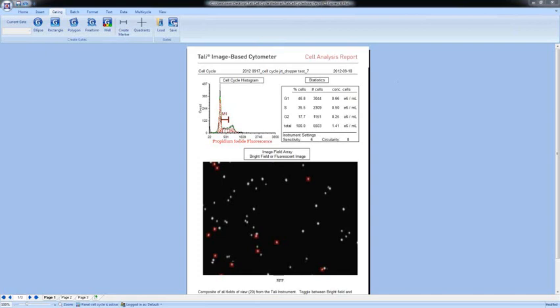And just to make it clear, if your G2-G1 ratio was 2.0 as expected, you wouldn't have to do any further analysis or any further changes. It would have detected that the model fit is perfect right out of the box.